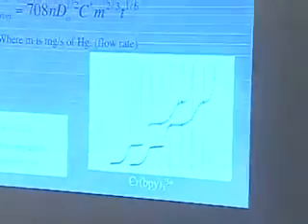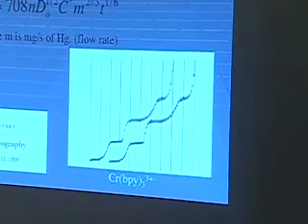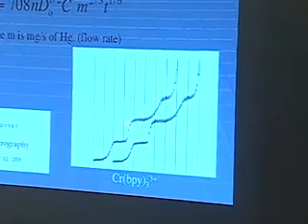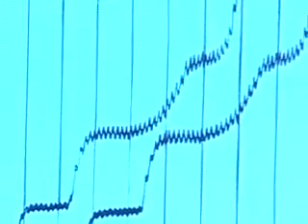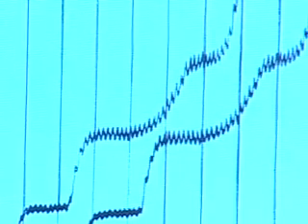when I have done this myself, and there are reasons today to do this, that jiggliness fills the page. I'm going, this guy Heyrovsky, wait, he did get the Nobel Prize, he did design the technique, is really good, because that's not bad looking. The little drop thing is pretty good. It's not filling the page where you can barely make out the waveform. And I couldn't figure out initially why he was so good, other than he was obviously good. And that's part of the answer.